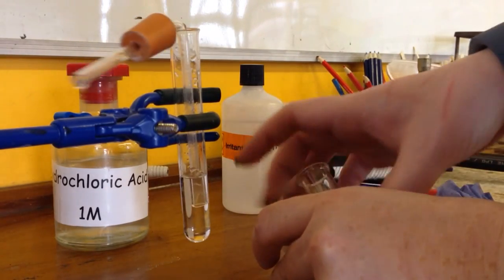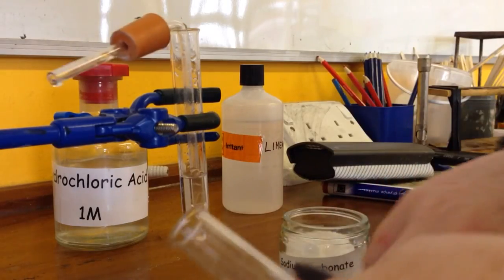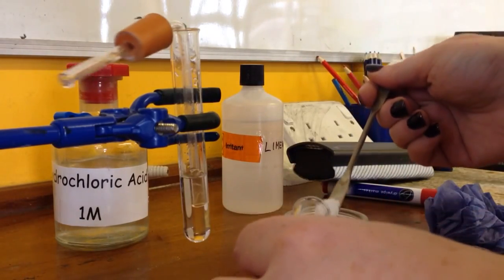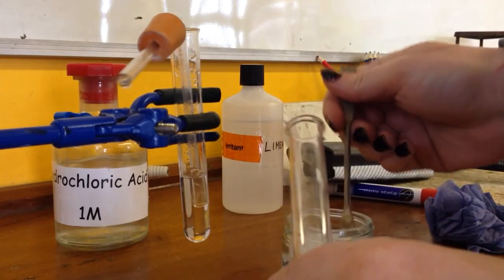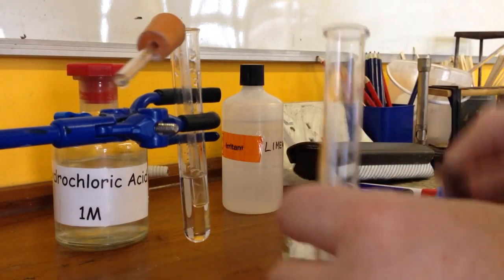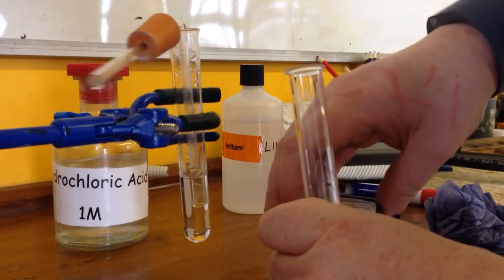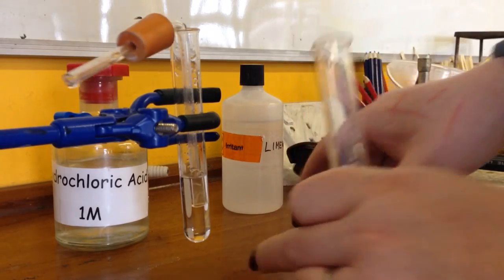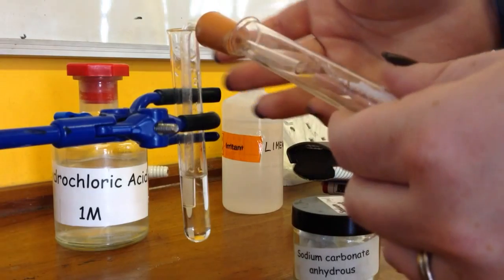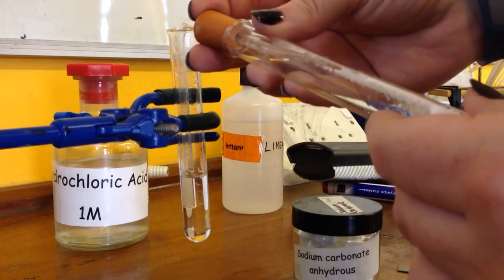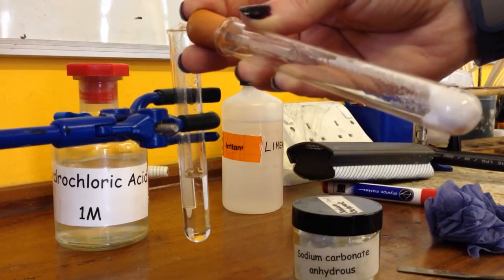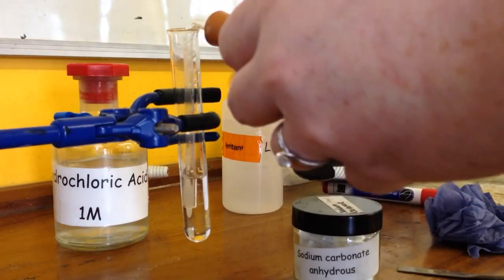I'm going to put some spatulas of my sodium carbonate into the bottom of a test tube, so it's all down the bottom there. And you need to be working quite quickly when you do this, because what you need to do is as soon as you add the hydrochloric acid to this test tube, you need to be bunging it straight away so that we can collect what happens.